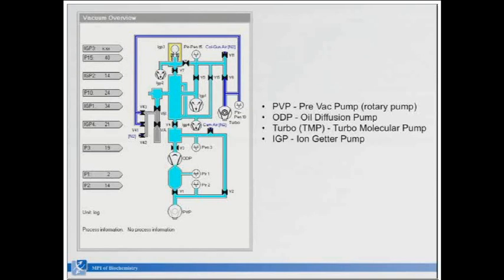You might wonder why I tell you this, because every one of you will use the term cryocycle at the microscope. Press a button, and what does the cryocycle do? It's very, very simple. It shuts down the ion getter pumps to heat them up, and it activates the turbopumps, because the turbopumps can remove the molecules out of the microscope. Ion getter pumps just let the molecules stick to the magnets. So to remove all the contaminants out of the microscope, you have to use the cryocycle, and during a session at the microscope, you create lots of vapor in cryo experiments all the time, and hydrocarbons, and these have to be removed at one point.